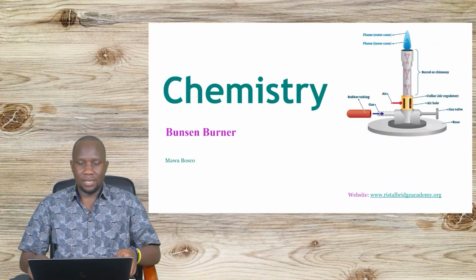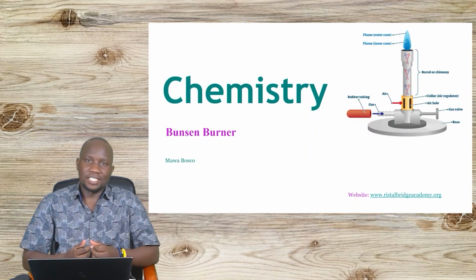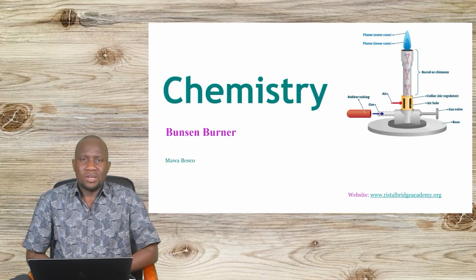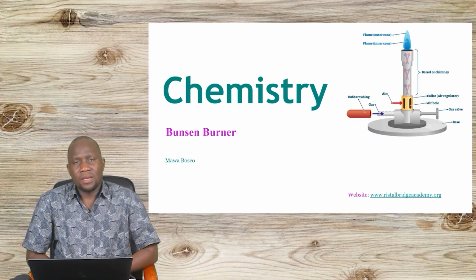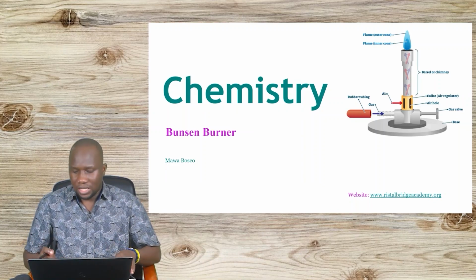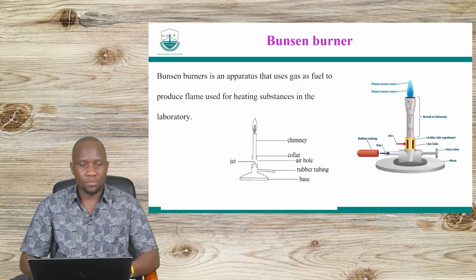Let us look at the Bunsen burner. We have just looked at heating chemicals in the lab, and we saw the different equipment that we can use for heating. And we did mention that one of those that we really frequently use is what we call the Bunsen burner. So, how do we use it? What are the different parts that make it? What are the uses of the different parts, and what precautions do we need to take when using it? And that's why we have this presentation.